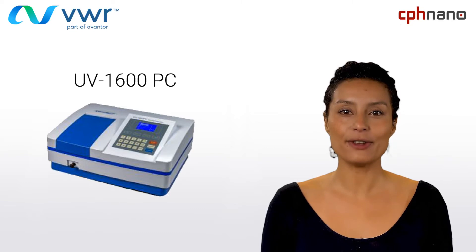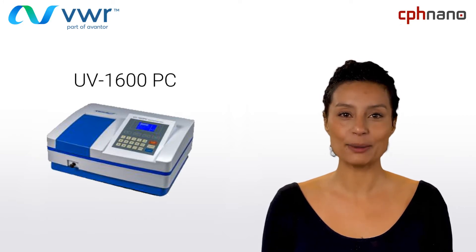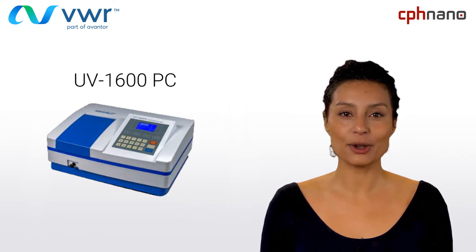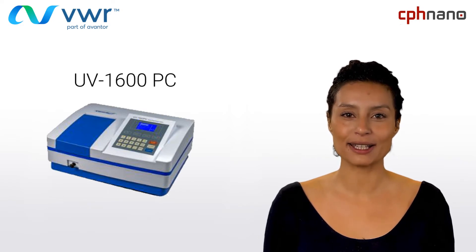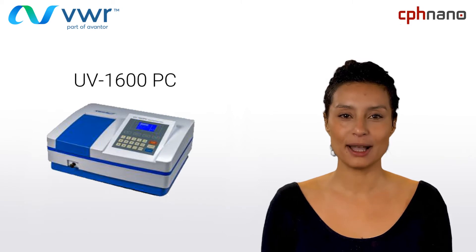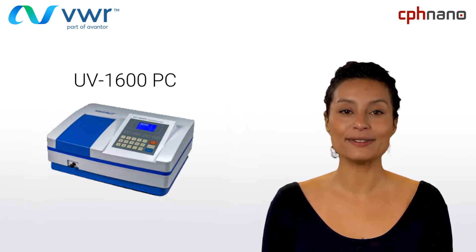Let me introduce you to a few of their most popular products. What you see to the left is the UV1600PC, a basic, economical and reliable spectrophotometer. It's ideal for daily routine control and teaching labs due to its ease of use, robustness and compact design combined with a high sensitivity and wide wavelength range. For the user requiring more advanced features, the instrument is compatible with a variety of optional accessories — for example, adding on the 8-cell changer will allow the user to read up to 8 cells automatically.